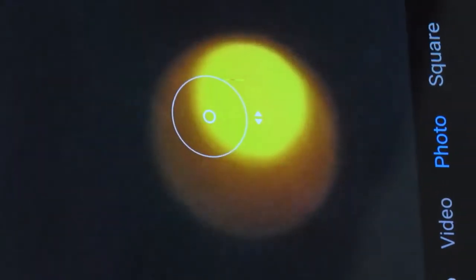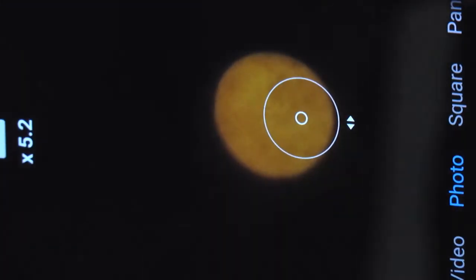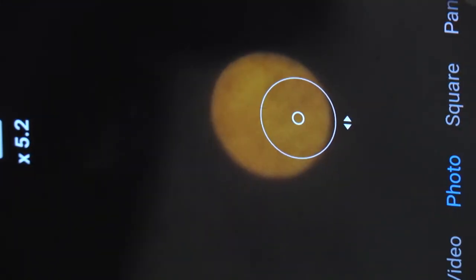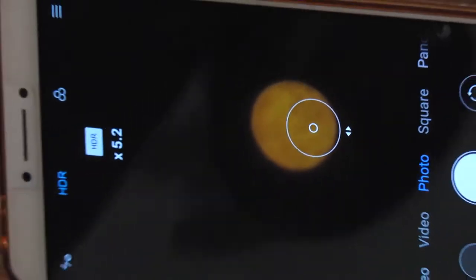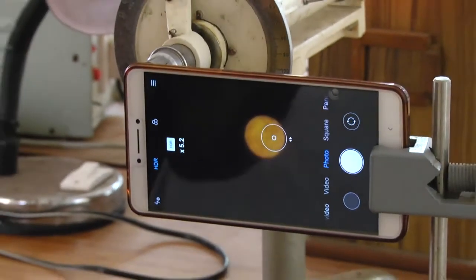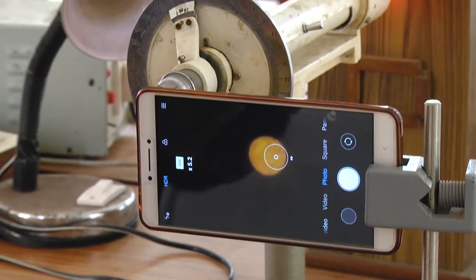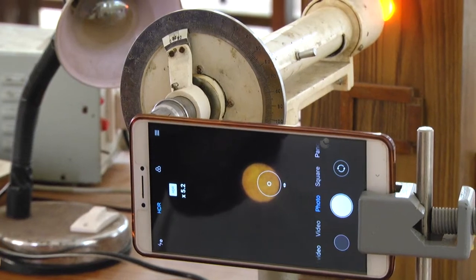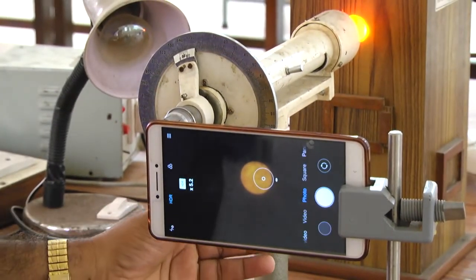I will show you that I was showing four uniformly bright both halves and four where half is bright, half is dark. So that condition should arise.